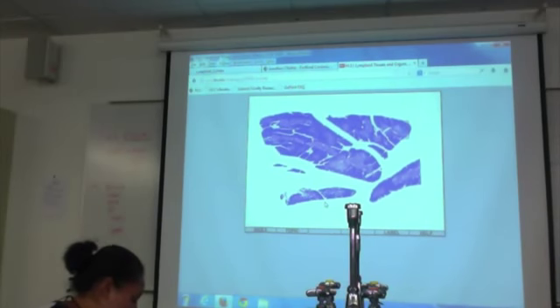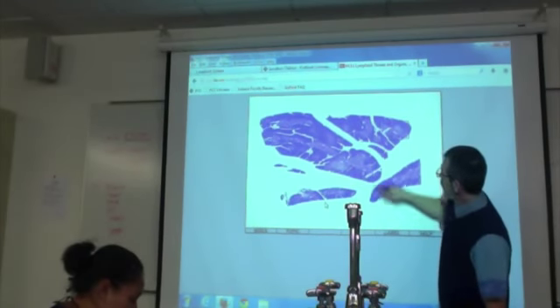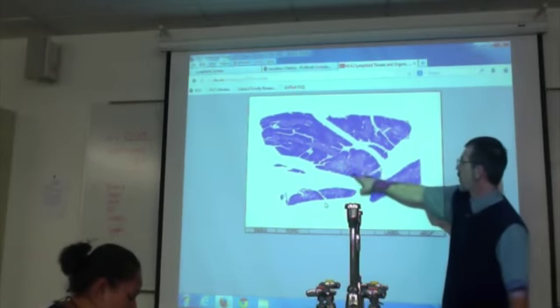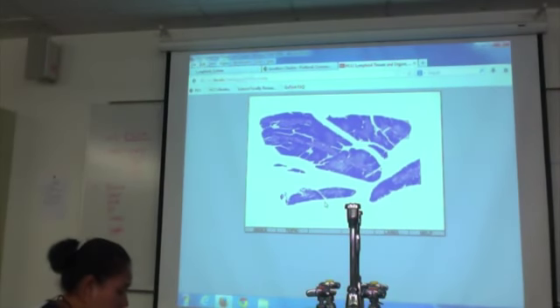The one that's kind of in the middle, it's not actually separated. Is that considered two lobules? I would consider it two. I bet you that it does separate, but just not right here. But if it did separate, then it'd be two lobules. I think it actually would be separated from the view.